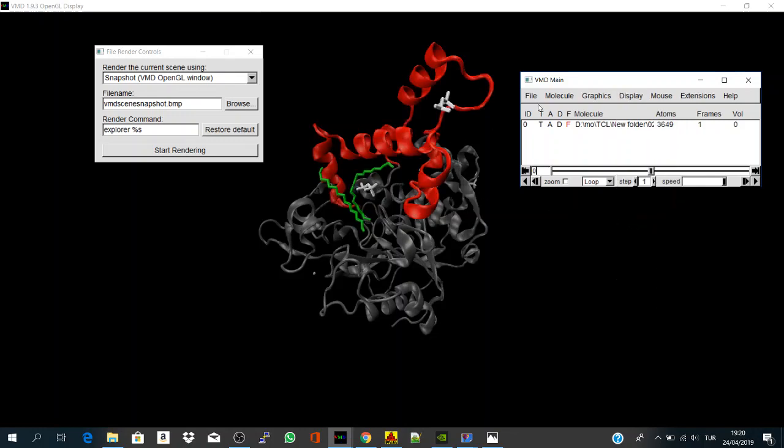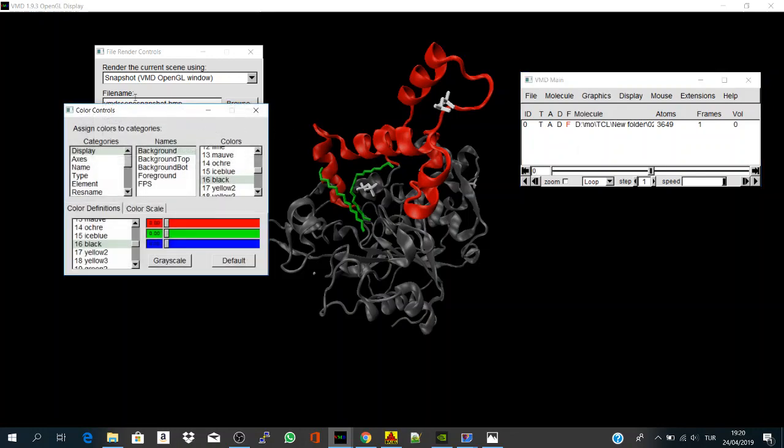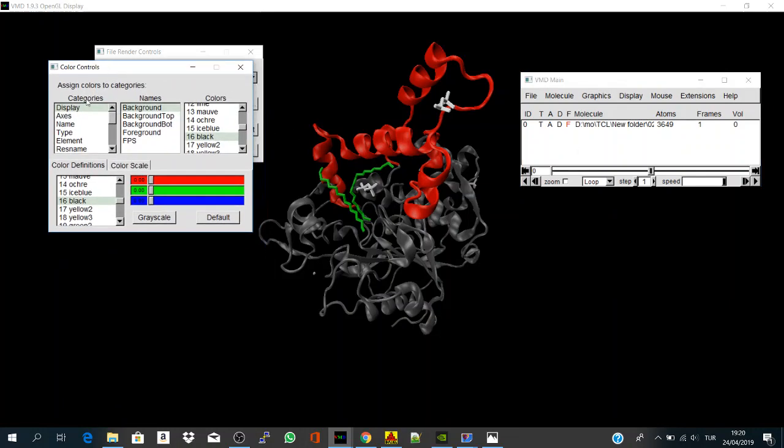One more thing is, for me, I don't prefer the black screen when I render files for academic publishing, so you may go to graphics and go to colors, and let's change the background color. So, display, background, it's black here, let's make it white.